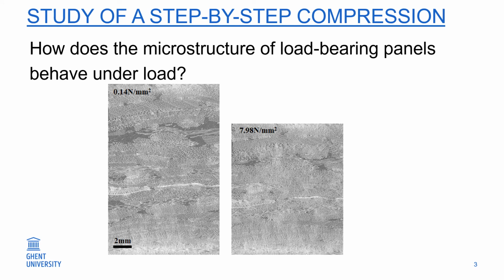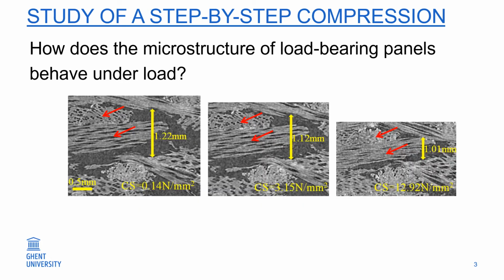Naturally, if you apply a higher compression, the structure shrinks. So here you see a couple of vertical slices through the 3D volume. However, because it is high resolution and fully 3-dimensional, we can zoom in on any feature we'd like. For instance, here we show a wood flake that is surrounded by relatively large air cavities. What's particularly interesting about it is that at the last compression on the right, you see that the wood structure compressed, but there still remain relatively large air cavities. That was kind of a surprise to us.